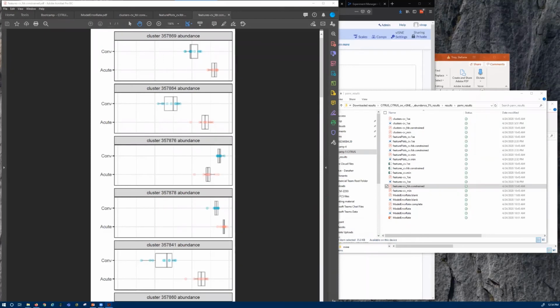So whether a number below 5,000 per file is reliable is pretty much the same question: what is the rare population you're looking for? First look at your rare population, then back calculate the minimum number of input events you would like to have for Citrus in order to identify your rare population.